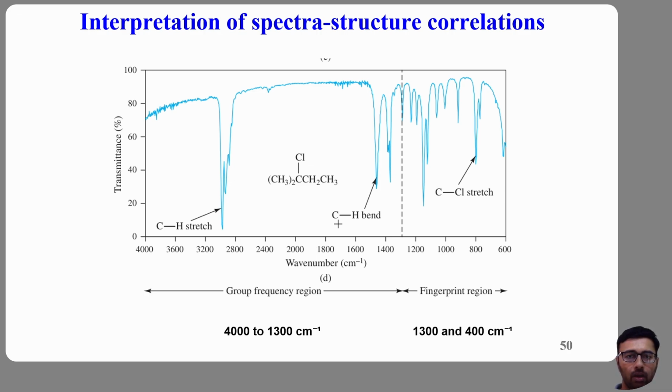For example, oxygen hydrogen stretches appear around 3200 to 3600 centimeter inverse. Likewise, other groups also do. This region allows rapid functional group identification. Even a quick glance can reveal whether alcohols, amines, carbonyls, or alkynes are present.